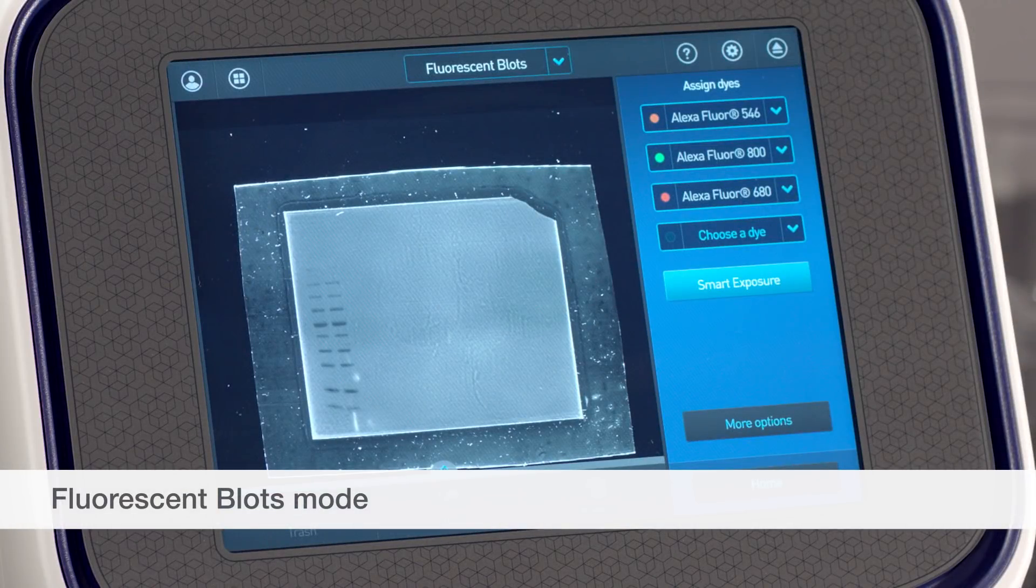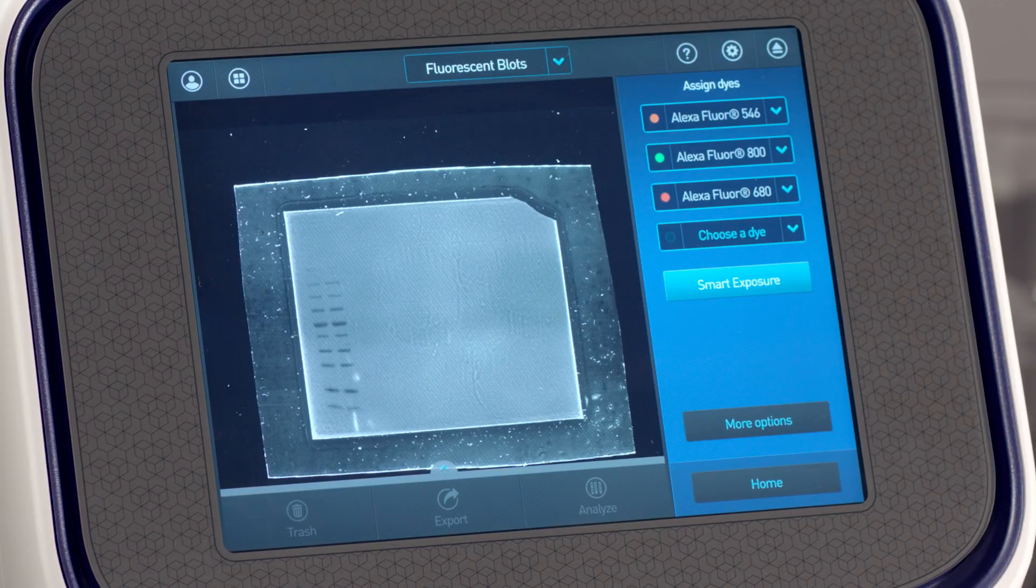In fluorescent blots mode, assign dyes based on your experiment. With Eyebrite FL1000, you can multiplex with up to four dyes.